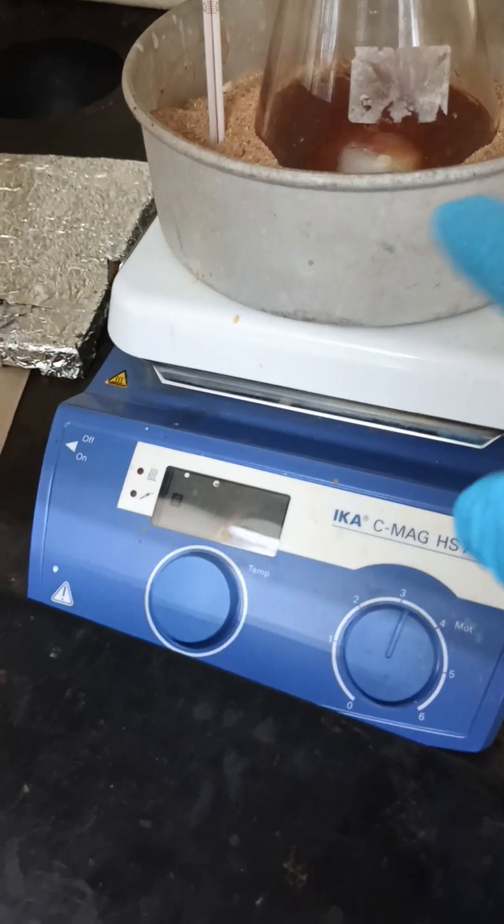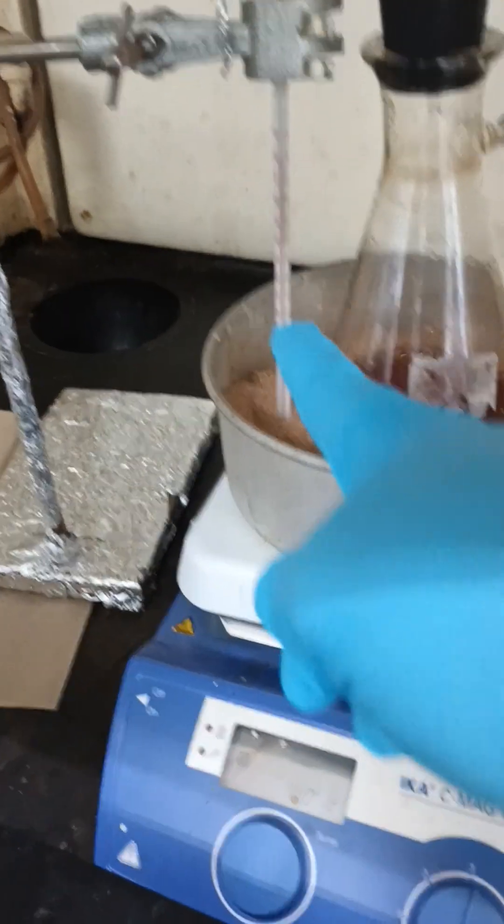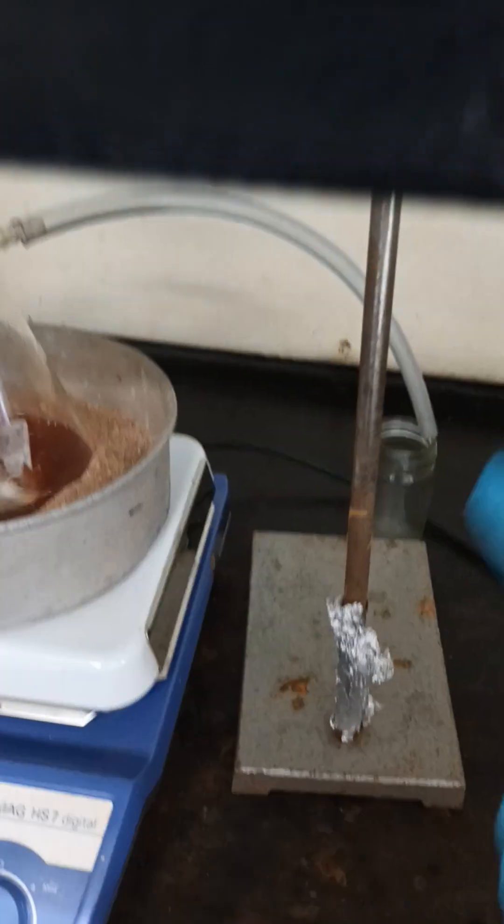This is for minimizing the heat rather than using direct heat. This is the temperature controlling — this thermometer. These are the iron stands, just for holding the others, like the thermometer and the bottle which contains the base.